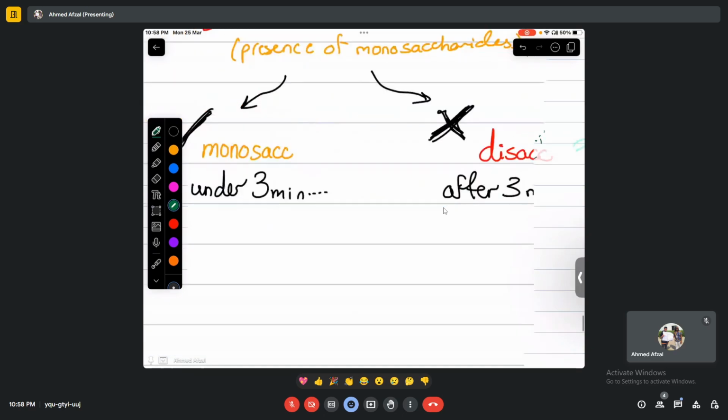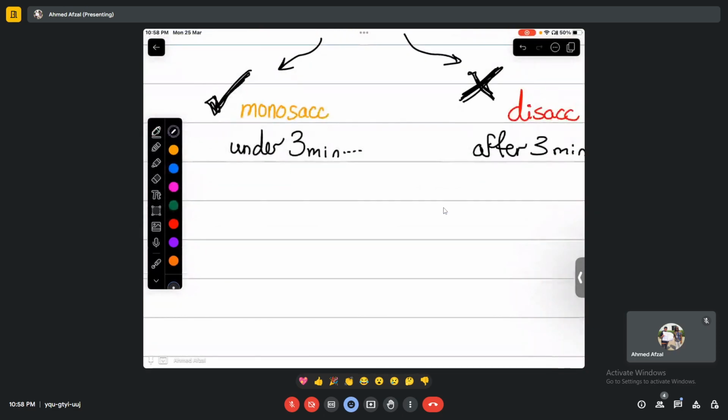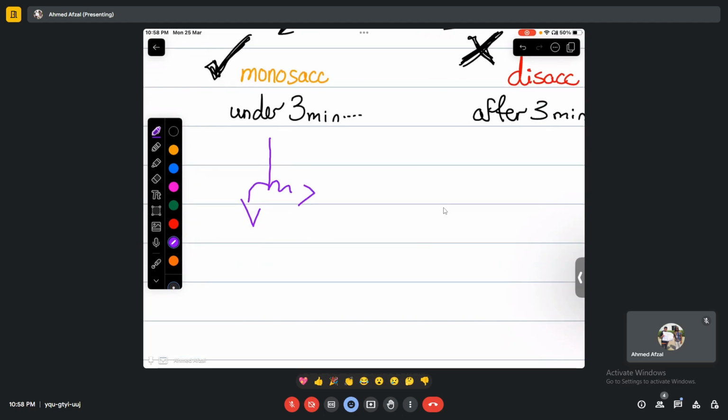Going back to a positive Barfoed test, so let's say within 3 minutes, Barfoed test became positive. That means that monosaccharides are present. Now we have to test whether the solution contains ketose monosaccharide or aldose. So we would conduct a test called a Seliwanoff's test. A Seliwanoff's test, if within 30 seconds becomes positive, that means that the solution contains ketose sugar.